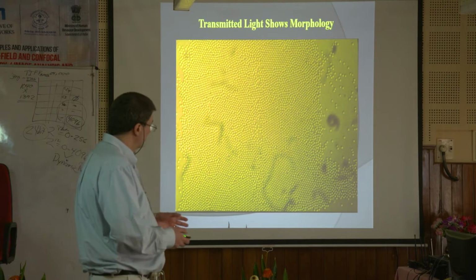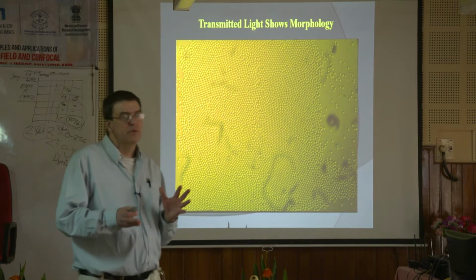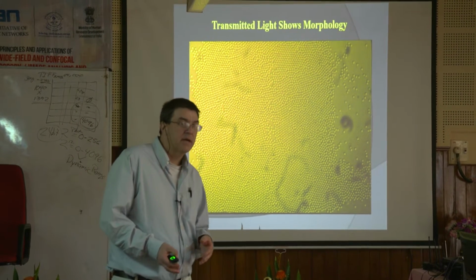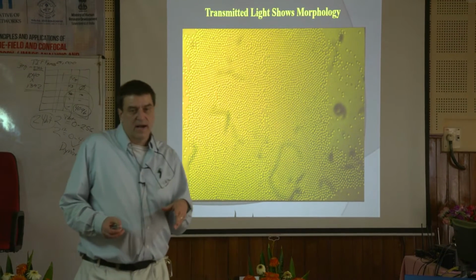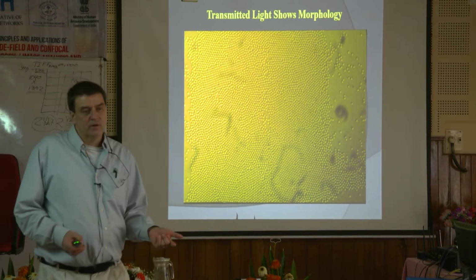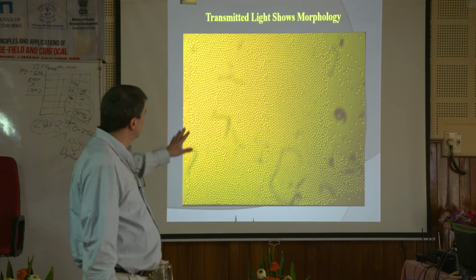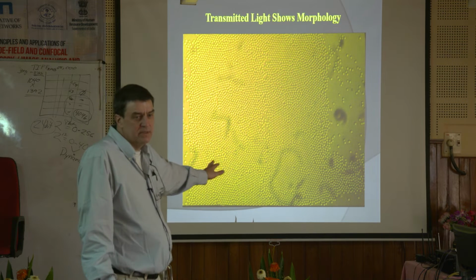Okay, so yesterday we looked at H&E slides and stuff, and we talked about, you know, if you do a paraffin slide embedding, you get better morphology, okay? And we talked about some white light techniques. We talked about phase contrast, differential interference contrast, Hoffman modulation, just ways to look at unstained things. So when you look at transmitted light, you see morphology.